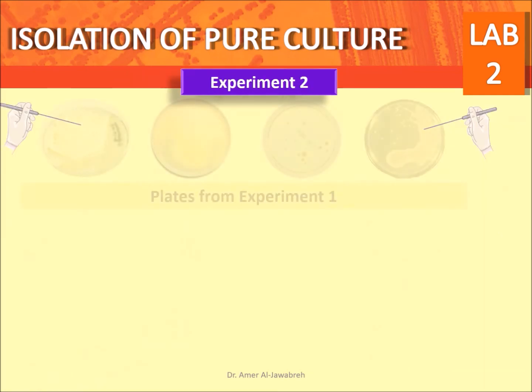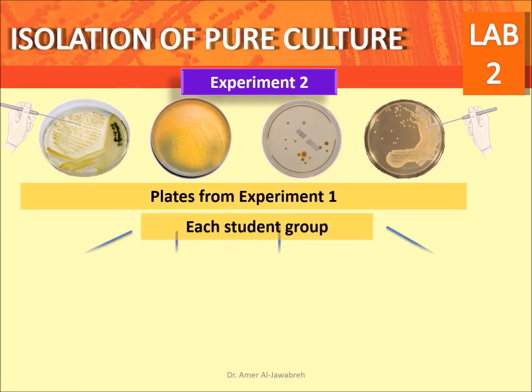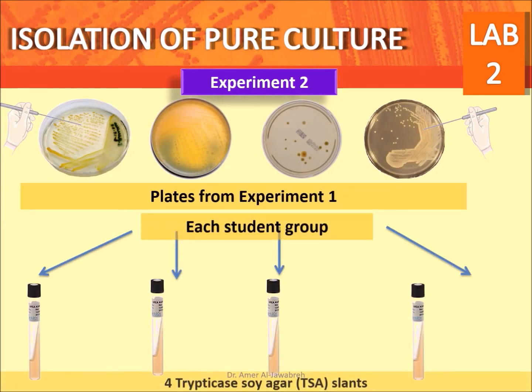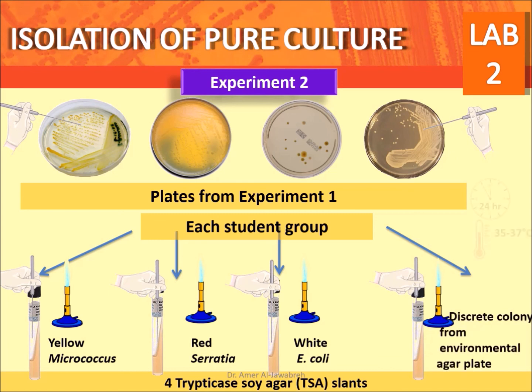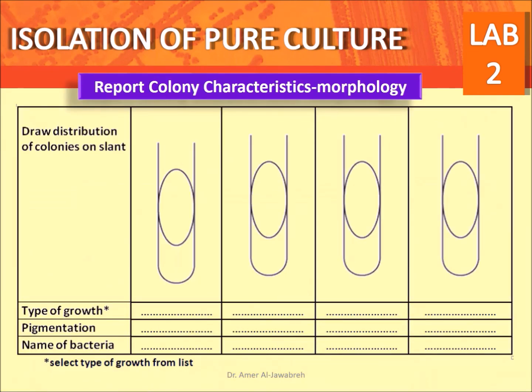To each student group, distribute 4 TSA slants. Pick visibly isolated yellow Micrococcus colonies, red Serratia, white E. coli, and colonies from the environmental agar specimen plate, and inoculate into properly labeled TSA slants as described earlier. Incubate all slants at 37 degrees centigrade for 24 hours. Report colony characteristics or morphology. Use this form for reporting results.